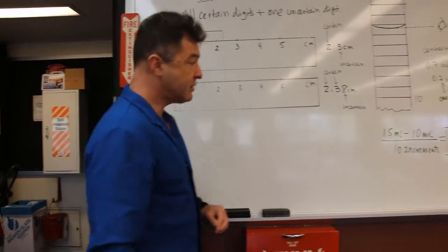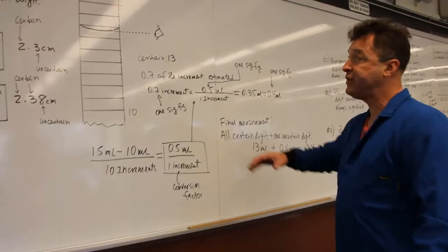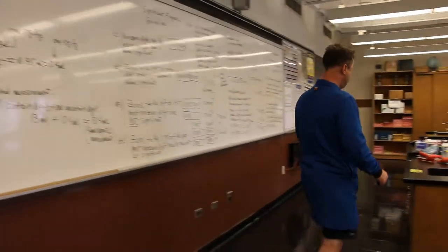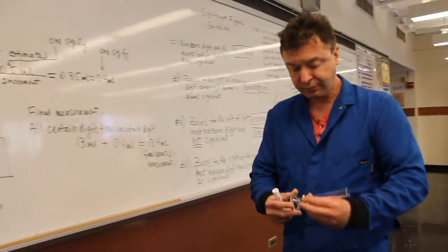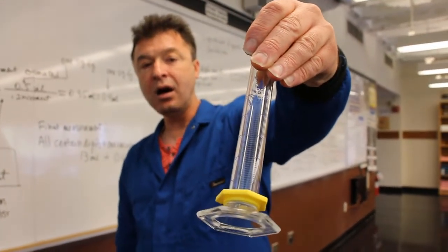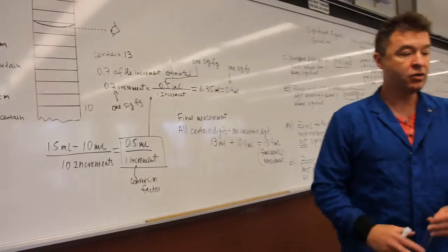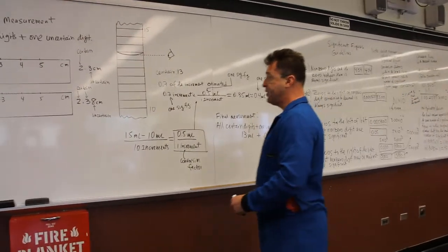So now the next device that I want to cover is called a graduated cylinder. Give me a moment, I'm going to bring one here to you. There it is. So how do I make a measurement with this? As I perform the density experiment, I will actually follow these rules to determine the volume of the liquid in this particular device.